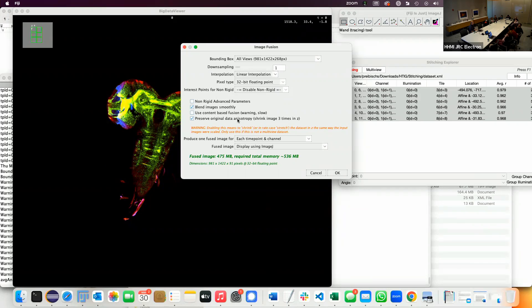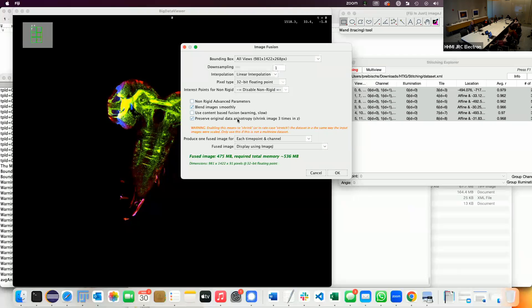Question: are the transformations between tiles in pixel coordinates of the tile or in physical coordinates? They're in pixel coordinates. It's all in pixel coordinates — then each tile has a first transformation that maps it into global space. Every input image has a pixel grid and then a transformation to put it into global space. At the end you apply an affine that inverses the anisotropy — it squeezes it back and usually it's fine.